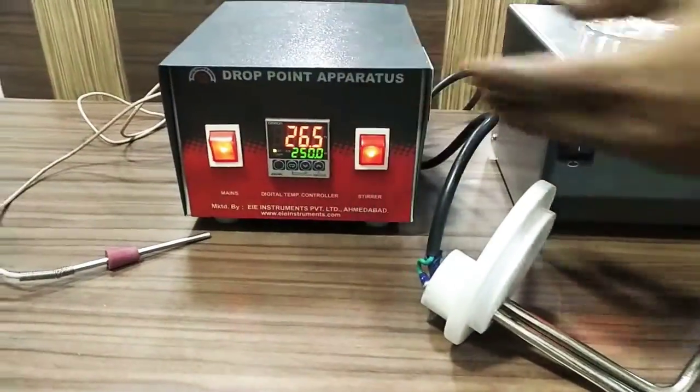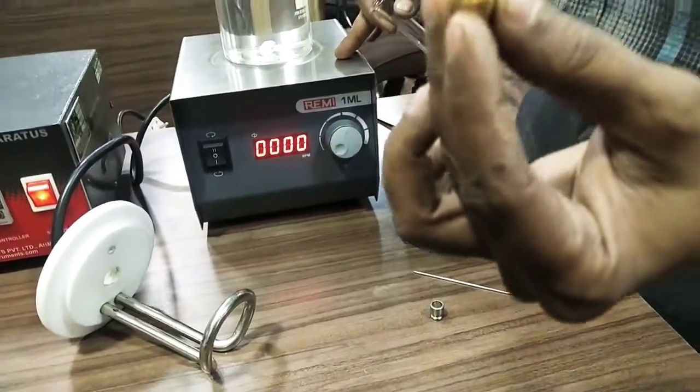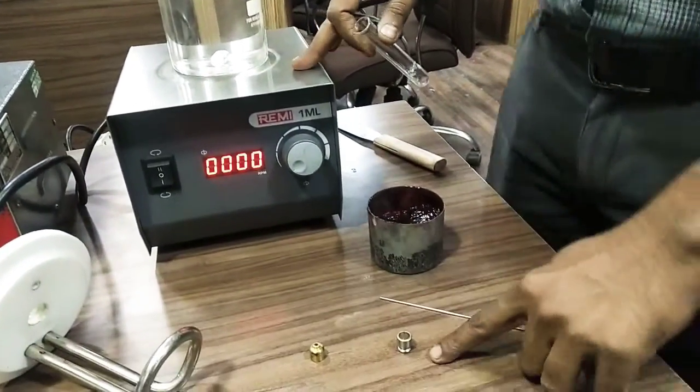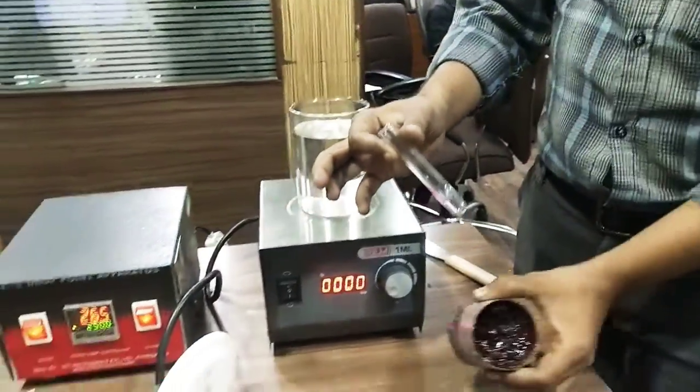This is the temperature control unit, this is the stirrer, this is the heater, this is the grease cup, this is the depth gauge, this is the rod, this is the test tube, this is the grease sample.